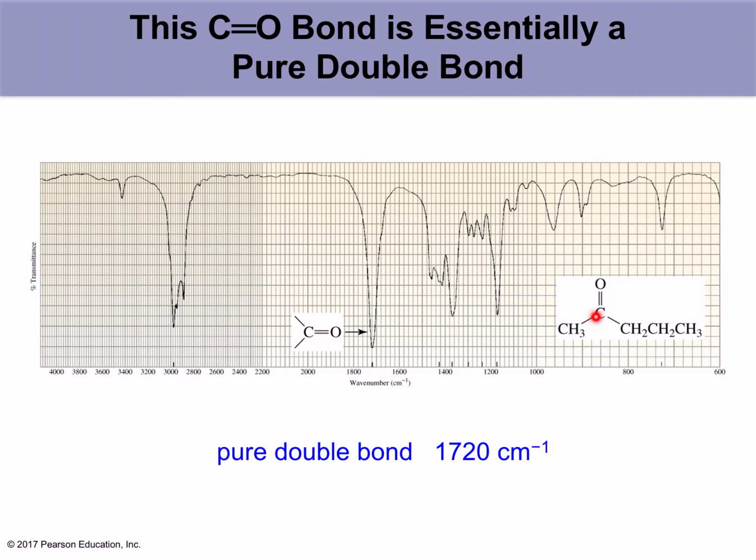Especially if it was a hydroxyl group you started with, since we don't have a broad OH peak here, you're going to be even happier, because your starting material has been completely consumed. You don't have that broad peak. That is the beauty of the IR. You can see quickly if a reaction has gone to completion or you have made the product that you desired based on the functional group.